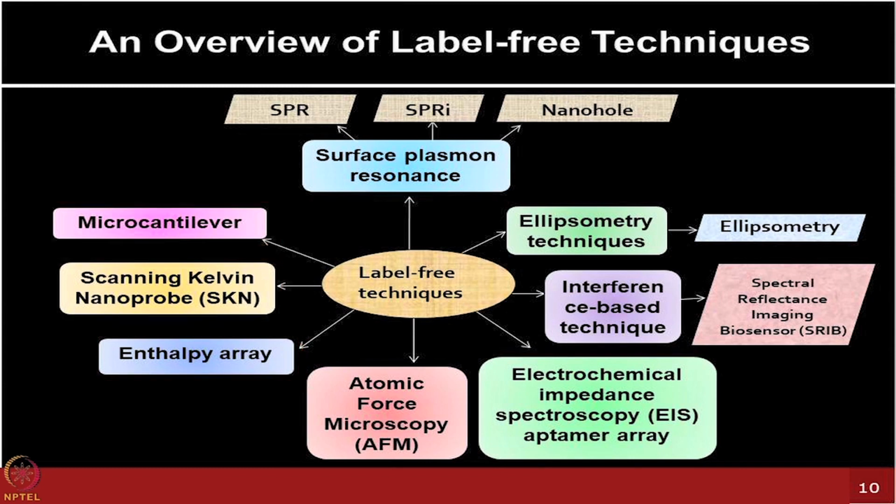So I'm sure you appreciate that there are many technologies which are under development right now. They're all looking at different physical principles which could be used for looking at biomolecular interactions in a label free manner. While we cannot talk about everything right now, at least some of them I will talk about. I'll give you some examples of those.